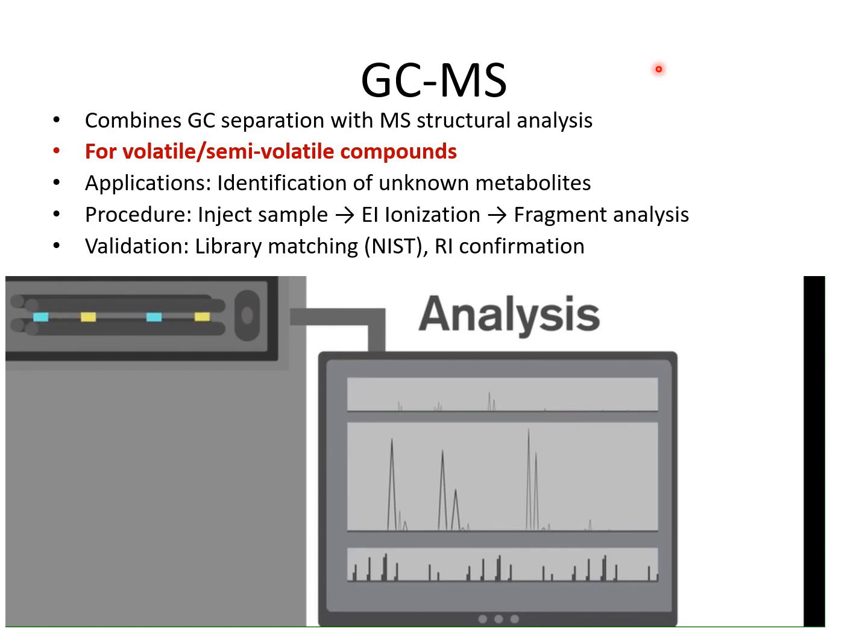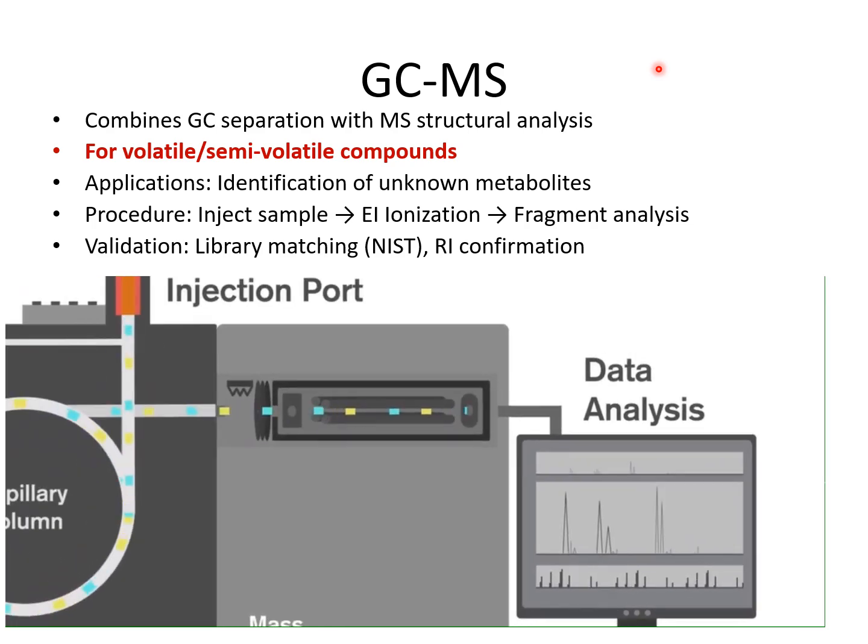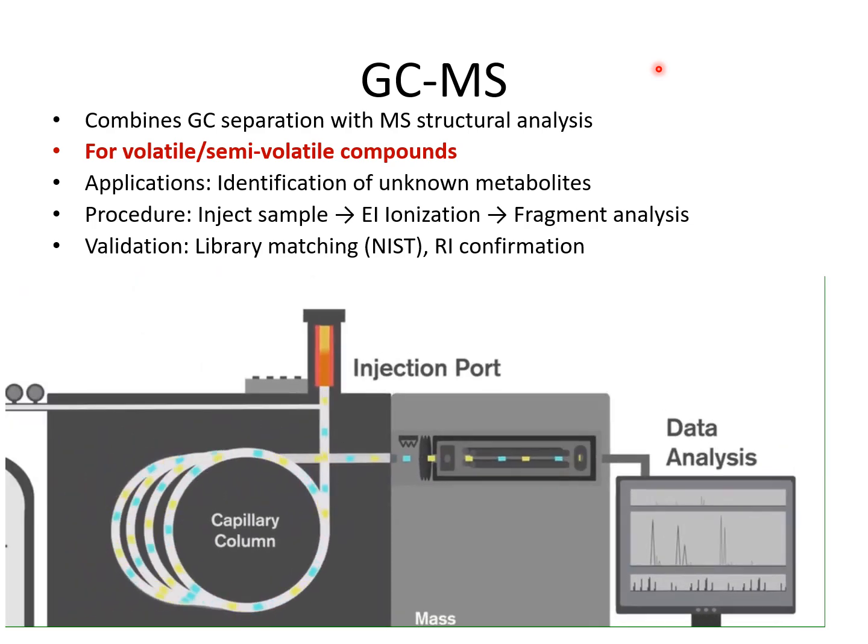So each peak area represents a compound in an analyte, and therefore the area percentage corresponds to the concentration of a particular analyte.